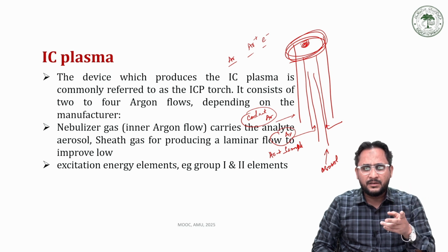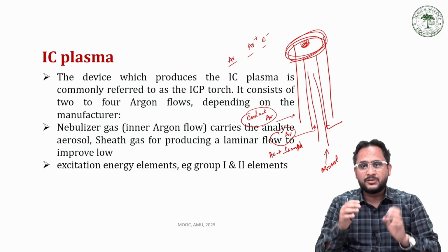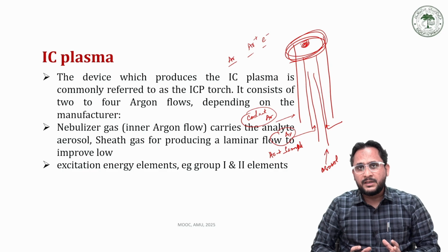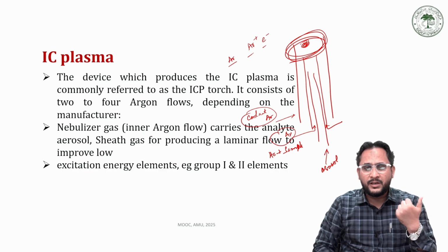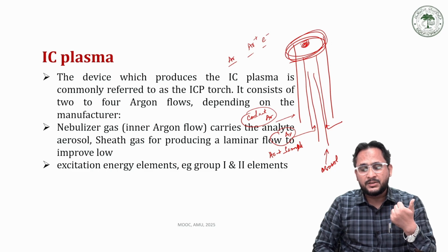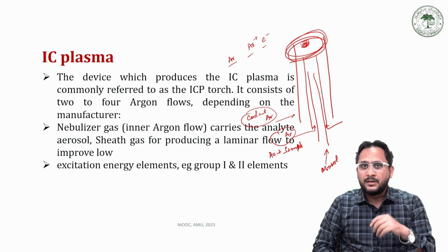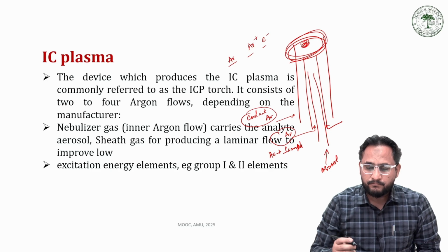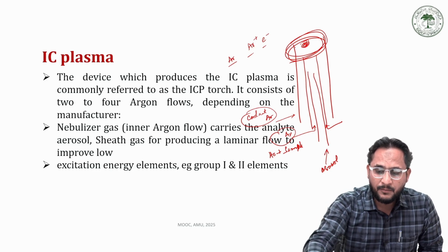Means argon gas which is having a temperature of -185, for nitrogen -196, and for helium it is around -260 degrees Celsius. They can be used, and that Dewar flask consists of two concentric cylindrical tubes made of stainless steel with a vacuum created in between to avoid passage of heat due to conduction and convection. And finally, the outermost cylindrical stainless steel container is coated with silver to avoid any absorption of heat, to reflect all the heat. So the Dewar flask is used, and we have a plasma created over here.